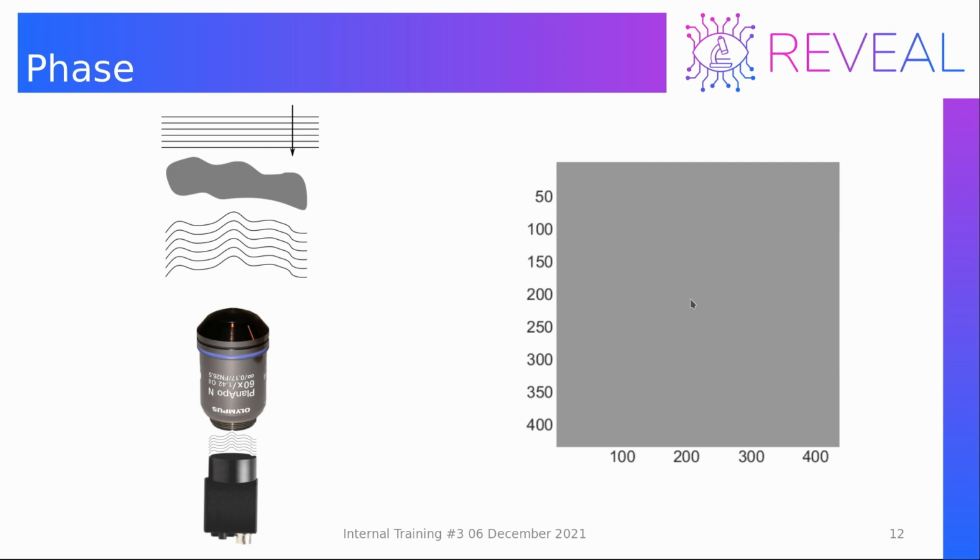This is of course not entirely true, because you will see something, probably some boundaries of the sample, maybe some gradient in the structure, but the contrast will be very low, and the values of the pixels will mean nothing, and I will explain it in a moment again. So how can we retrieve the information about this distortion of the plane wave?